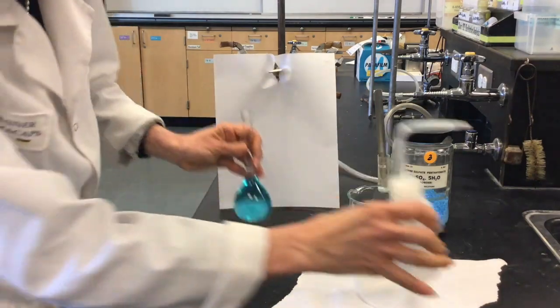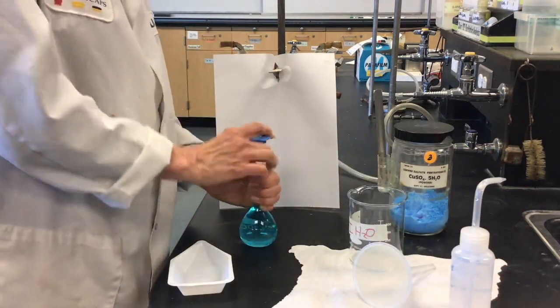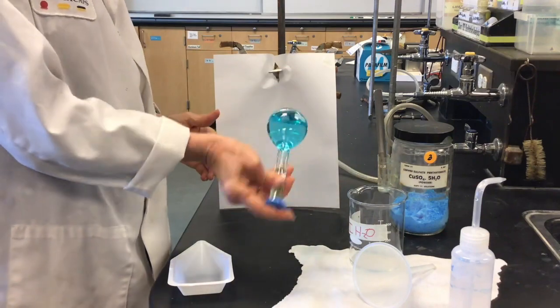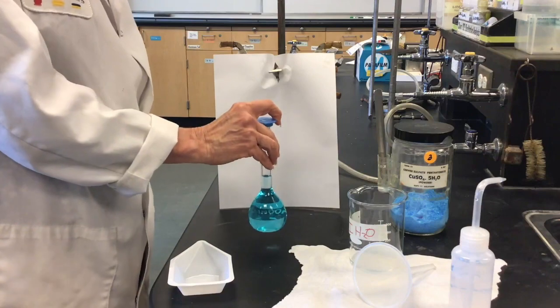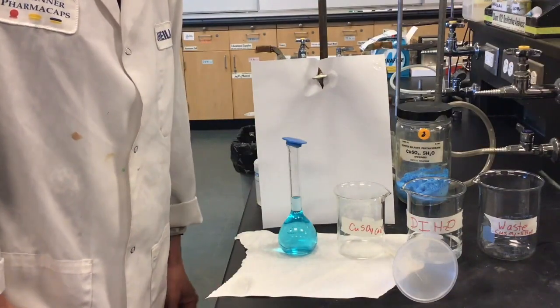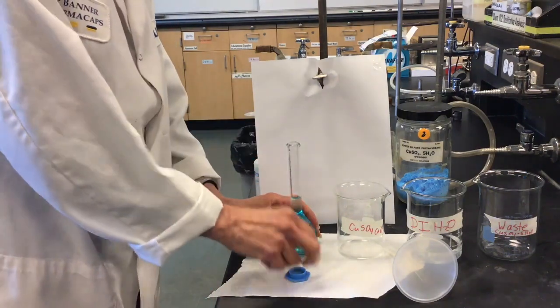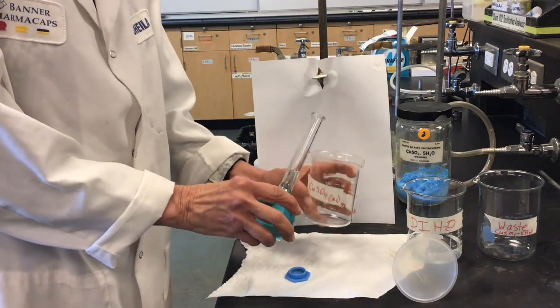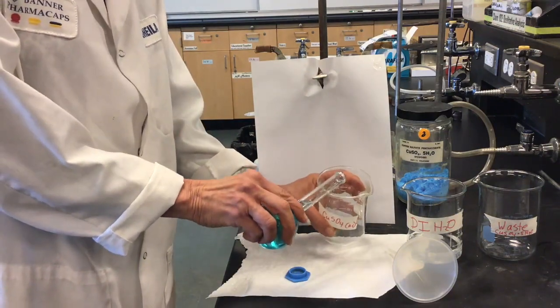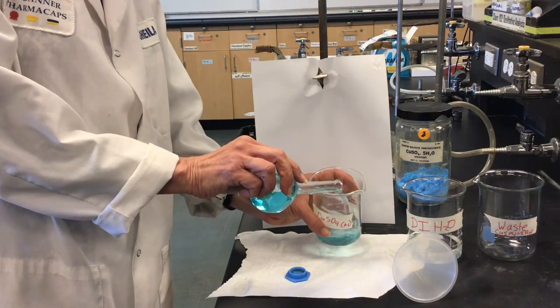And then to do a thorough mixing of our solution, put a cap on. And now we've made our aqueous copper sulfate solution. For part C, we'll be making our dilute solution of copper sulfate pentahydrate. We'll begin by transferring our concentrated solution, which is from part B, that you'll calculate the molarity. You're going to transfer that into a clean, dry 250 ml beaker.